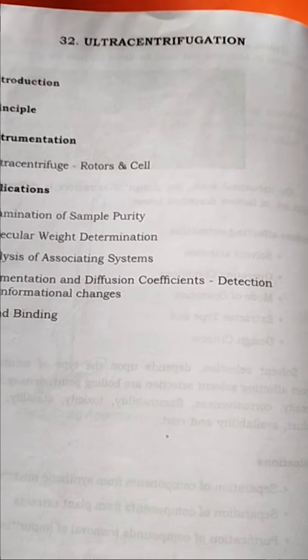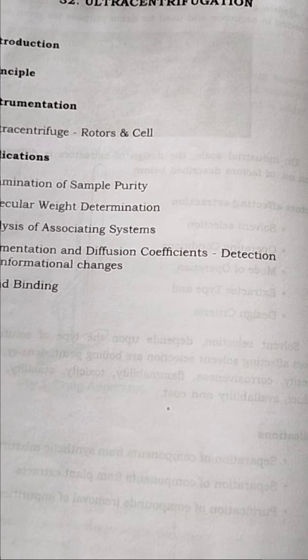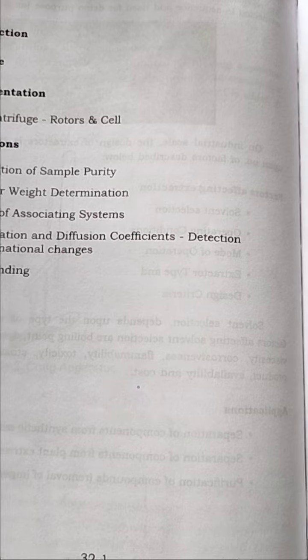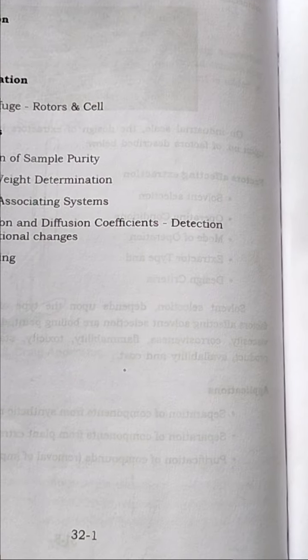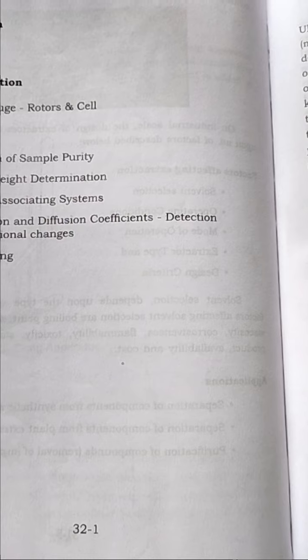Today's topic is ultracentrifugation. Ultracentrifugation is used to denote analytical ultracentrifugation, which is used to analyze biological molecules like macromolecules. What are the macromolecules? Proteins.